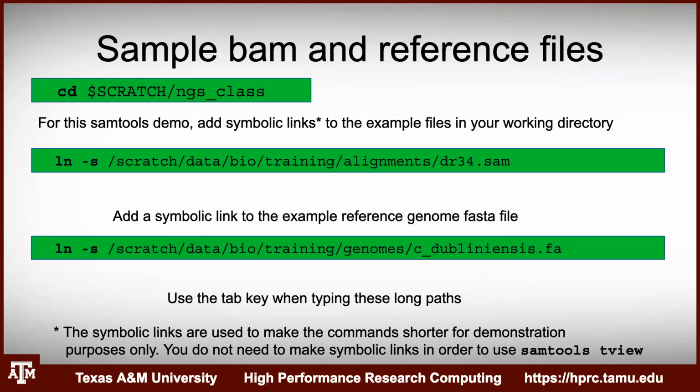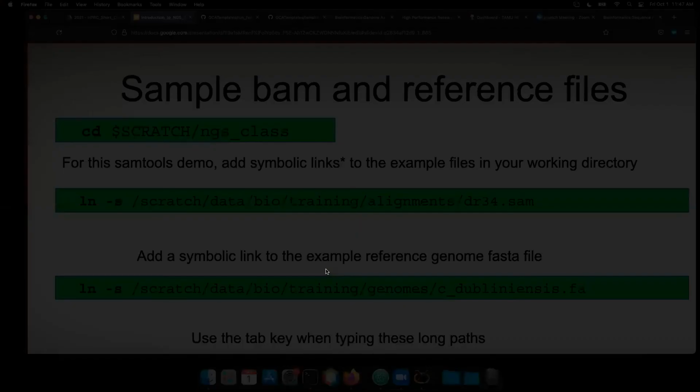Do this for the alignment file, the DR34 SAM, and the genome FASTA file. You don't need to do this when you're using your own data. This is just for demonstration purposes. So I'm going to do this as well.